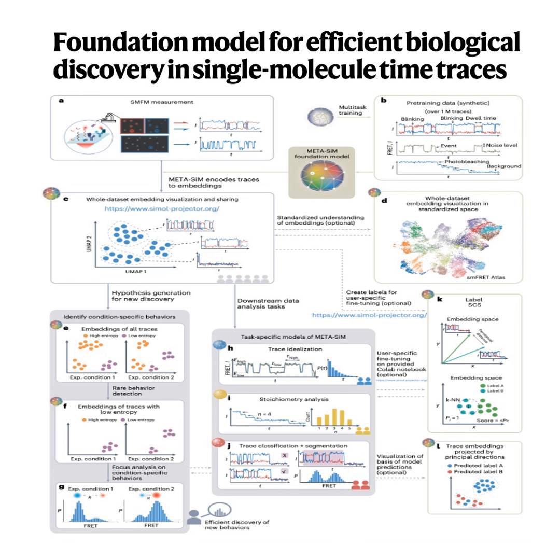But with simulated data, you programmed it. You know precisely which states existed and how fast the transitions were supposed to be. Exactly. You have the perfect labels. This massive, diverse dataset, where every trace has a known correct answer, allows the foundation model to learn the fundamental patterns and relationships in molecular dynamics much more deeply than it could from messy, uncertain experimental data alone.